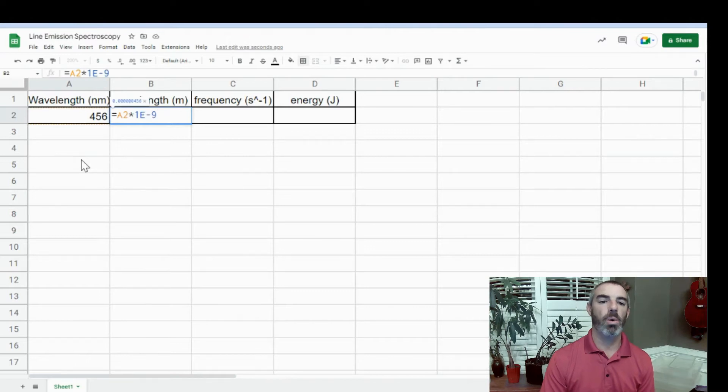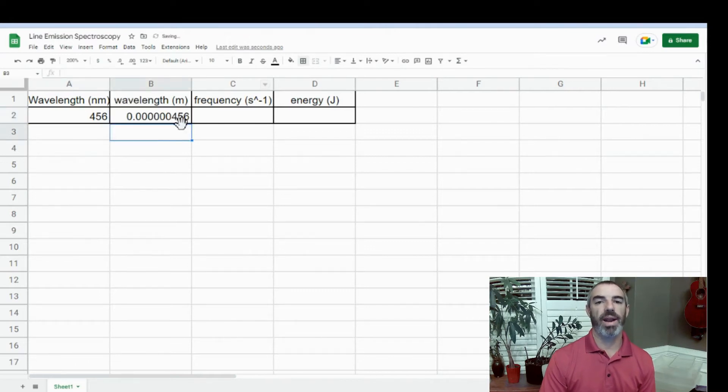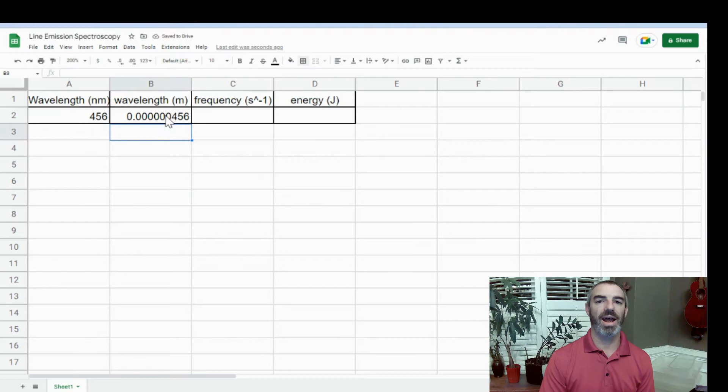Times 10 to the power of is the capital E. Then I press Enter, and I can see that I get this long decimal.